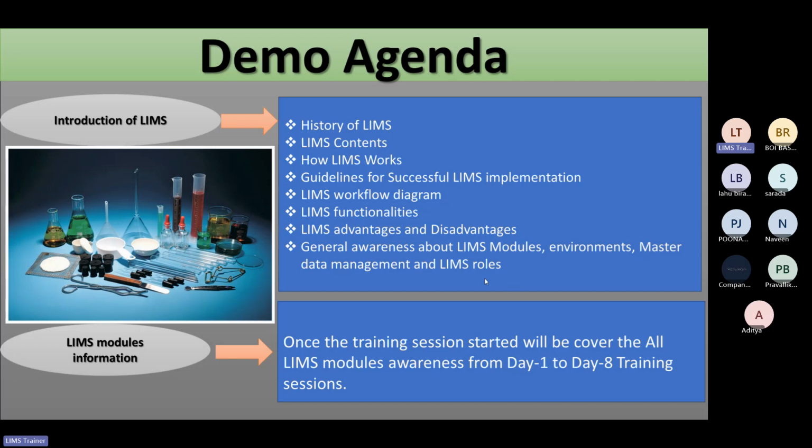This course is designed to take up to 1 month for completion. All the sessions will be in the evening, 9 to 10 p.m. Here I will also explain what we include in the sessions. So let's go ahead. Do you have any questions here?